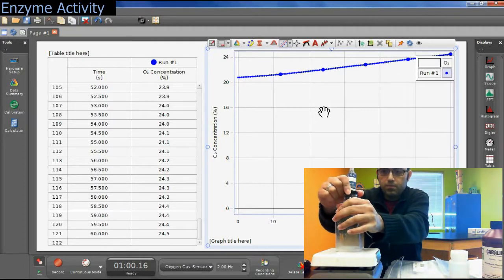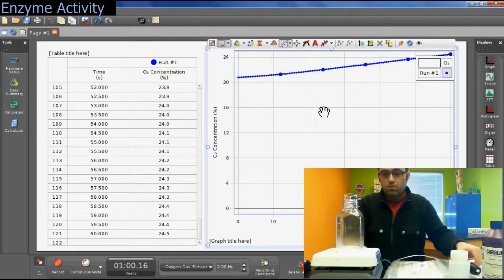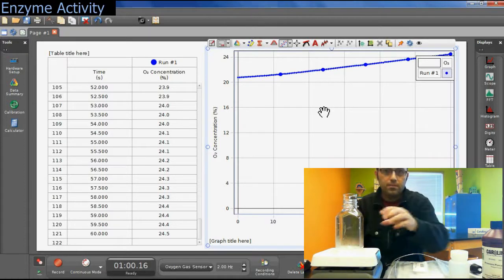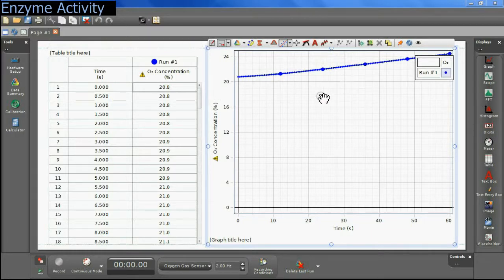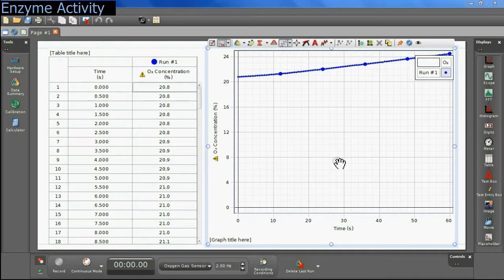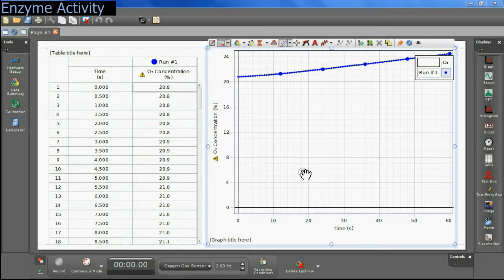Now I will remove this, stop my stirrer, and clean up. The conditions for this particular reaction are 3% hydrogen peroxide as the substrate, 14% yeast suspension as the catalase source, 35 degrees Celsius temperature, and pH of about 6. You are going to change one of these conditions — you can pick temperature, substrate concentration, or whatever you choose — and do the same experiment under those different conditions.